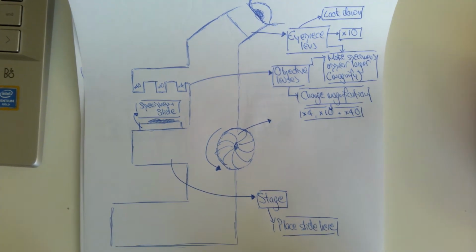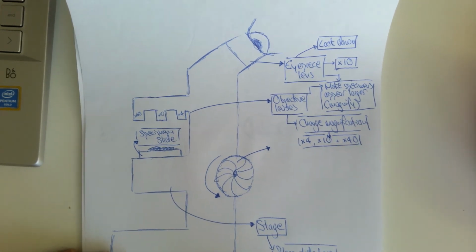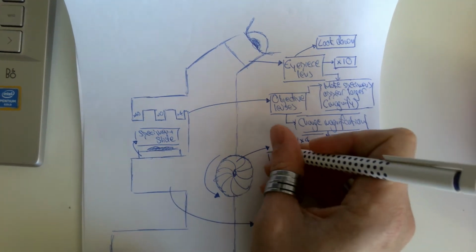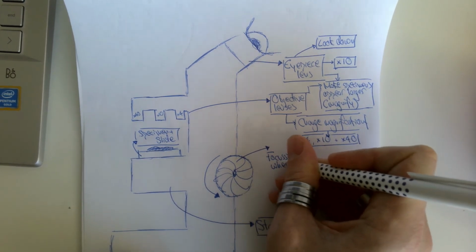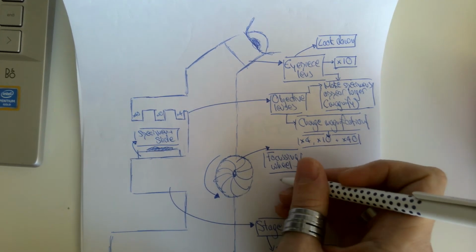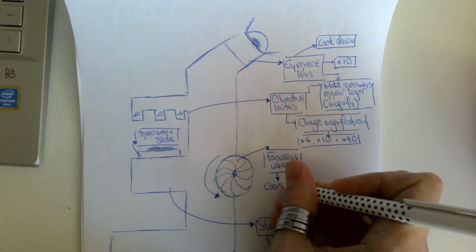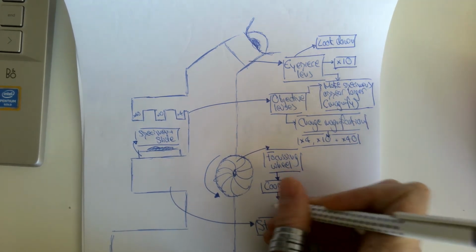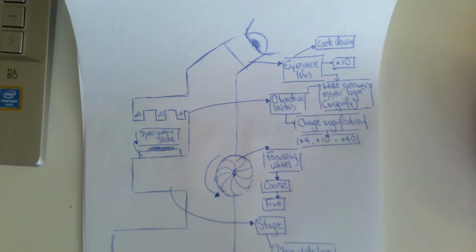Now, the other main component of a standard light microscope that you use in class laboratories is this here that we often call the focusing wheel. Now, on some microscopes, there are two, a big one and a small one. And these are often referred to as the coarse and the fine. Coarse and fine focusing wheels.